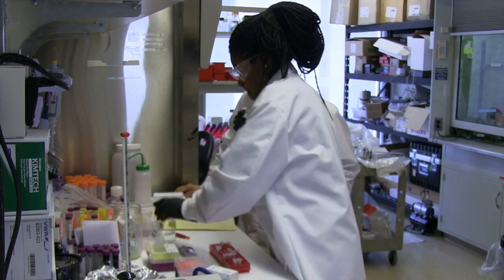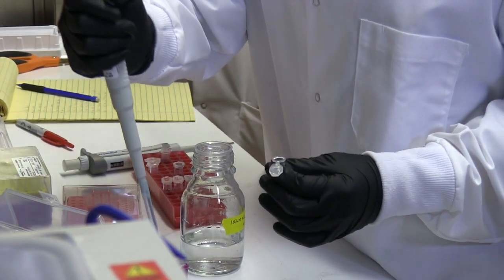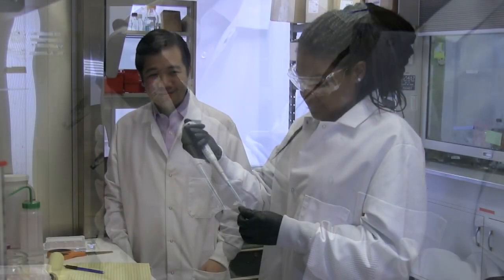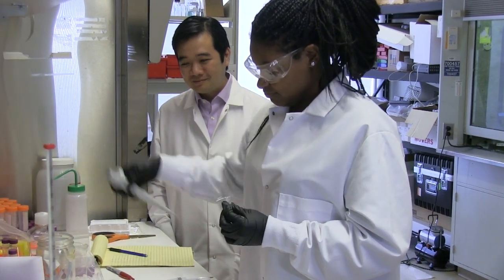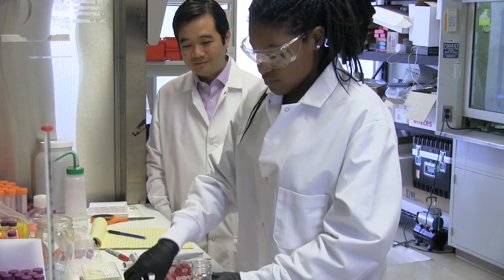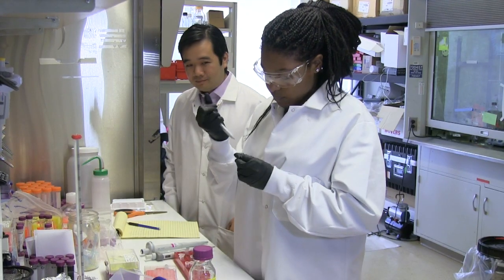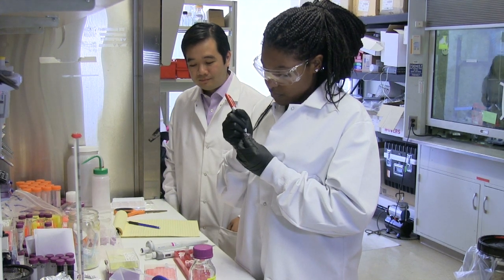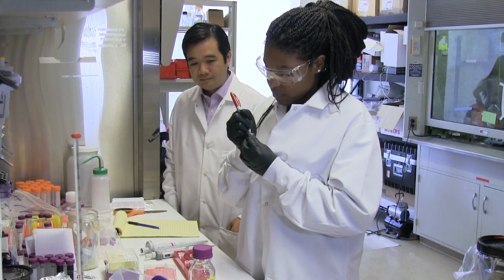In my lab back at Howard, I work to synthesize silver phosphate nanoparticles and encapsulate them in polymers. So I actually have experience working with nanoparticle synthesis. Right now I'm working on the synthesis of the sensors, and we're going to test its response to hydrogen peroxide. We're going to measure the fluorescence intensity, whether the peak either increases or decreases once we introduce hydrogen peroxide to the sensor. And then later on down the line, we're going to start working with cells and see how the sensors work inside the cells with hydrogen peroxide.